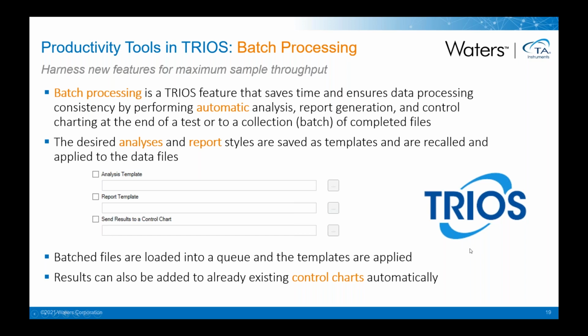Now, as I just mentioned, there's also the data handling and the analysis side of things, and so there are some productivity tools already developed for Trios, for every version of Trios, which is the software platform for control and analysis. There's a batch processing feature that allows you to establish an analysis template for your data. So if you're working through the same types of materials and you want to apply the same kind of analysis, you can associate that analysis with every run that you make.